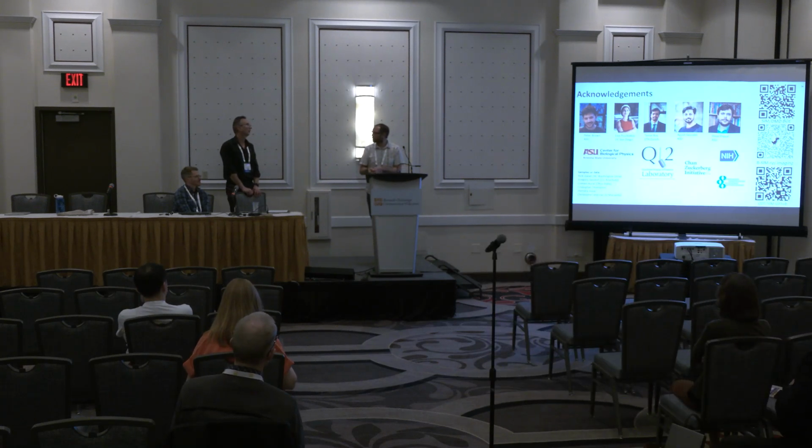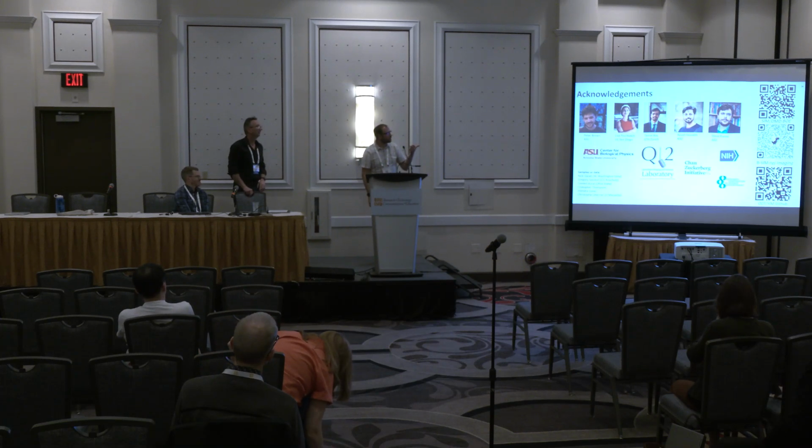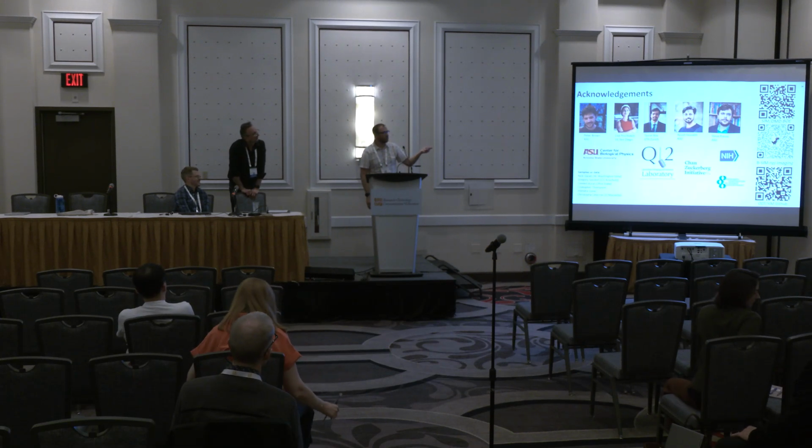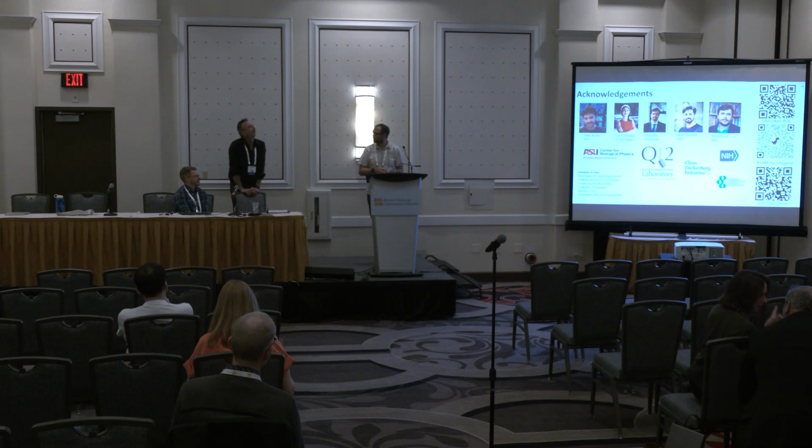This sounds like a lot of computation, so how fast can you go? The images I show here run on a laptop in an hour or something. If you use a big computer, you can do full 2048 by 2048 in a couple hours. So it's not fast right now. I'm not trying to hide that at all. It's an idea that we're hoping to push forward in the future.